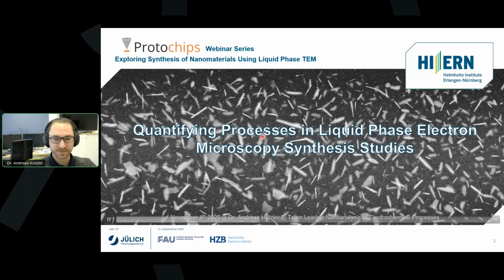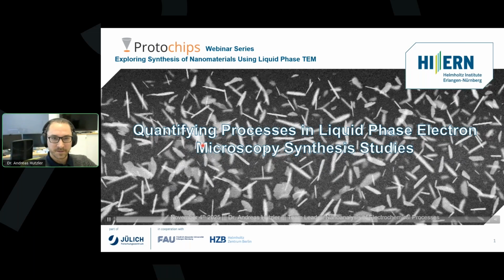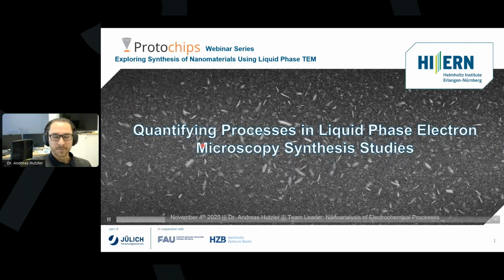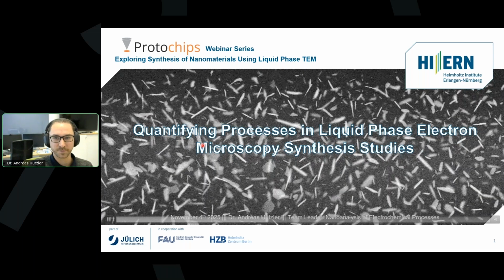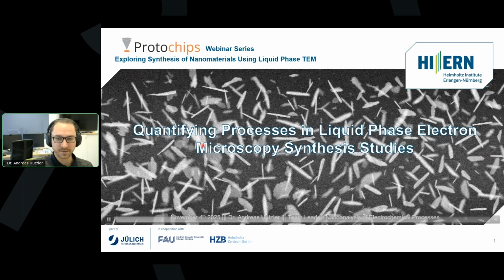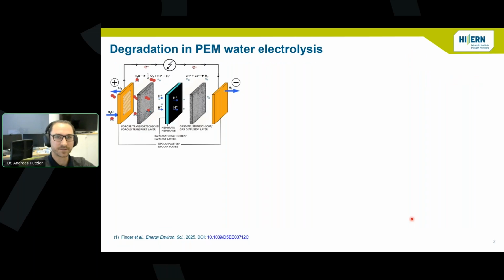We have been working with liquid phase electron microscopy since 2014. Today I'd like to give you a few insights into what we are doing with liquid phase EM, also in terms of quantitative analysis of processes that are observed with liquid phase EM. But before I go to the synthesis studies, I actually want to do the opposite: look at degradation first, because this is what we have been doing over the past few years.